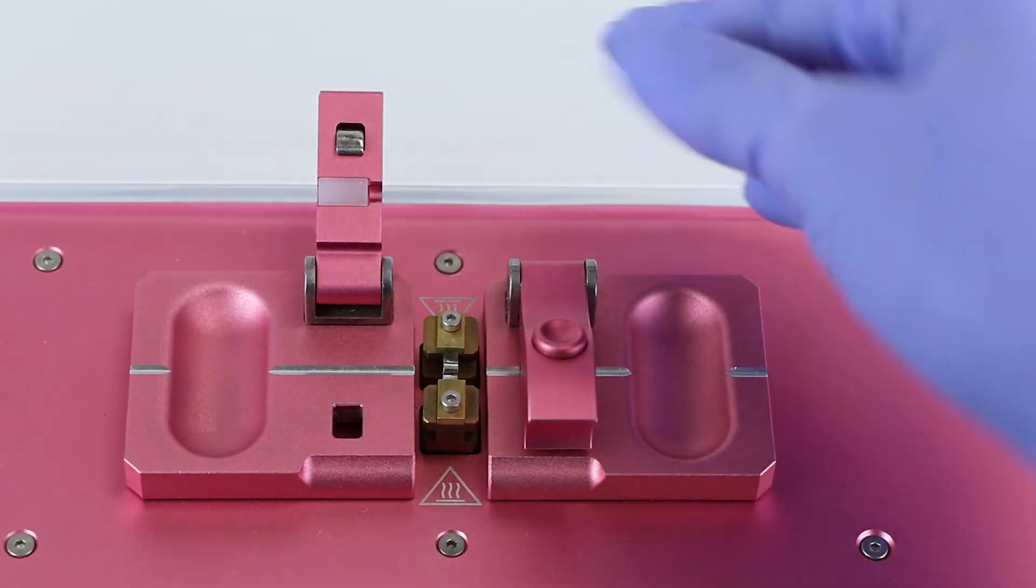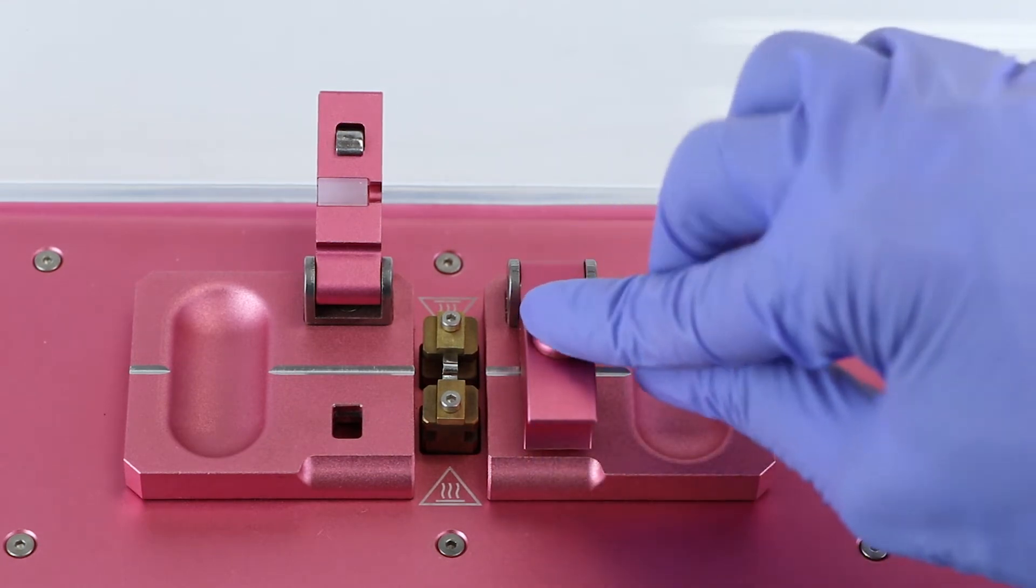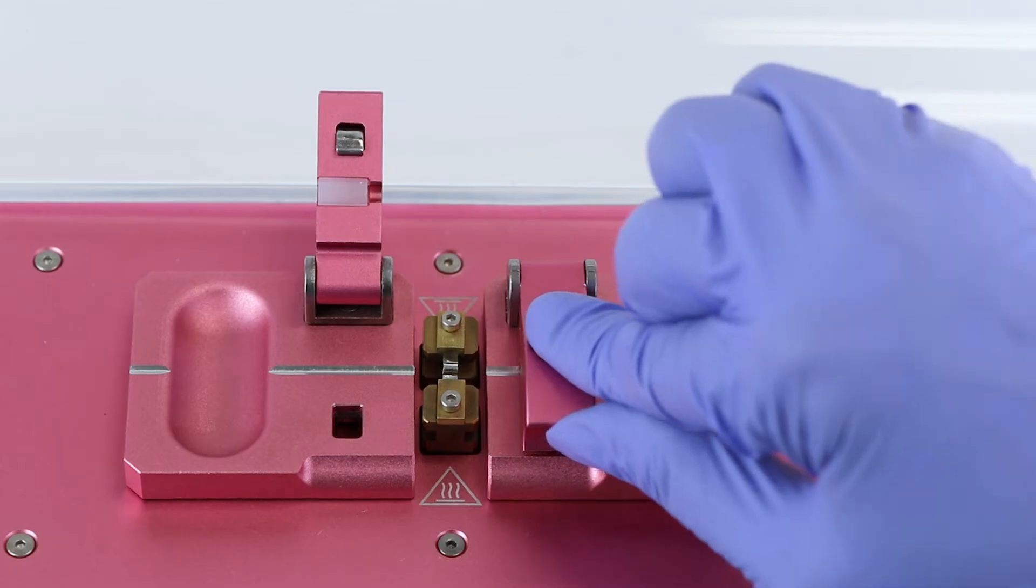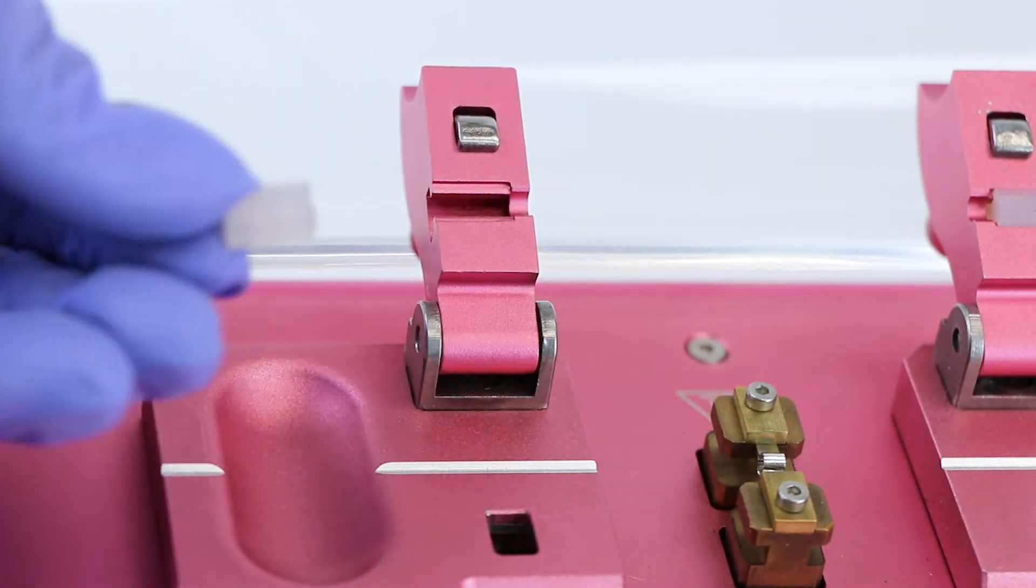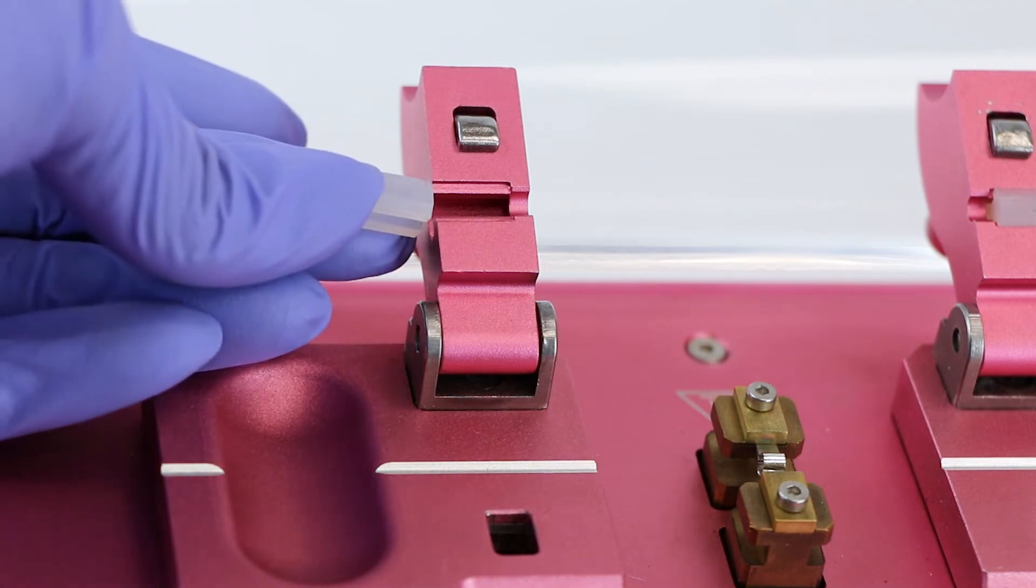Place your thumb under the clamp and depress the release button with your index finger to unlock the glass capillary clamp. Slide the glass capillary clamp pad matching the outer diameter of your glass capillary into place.